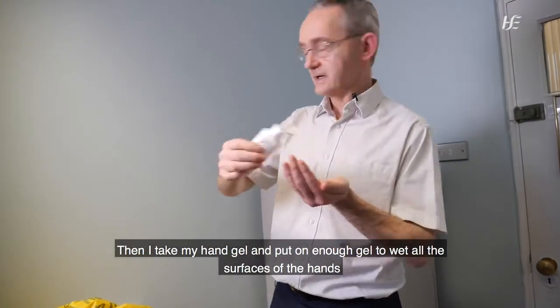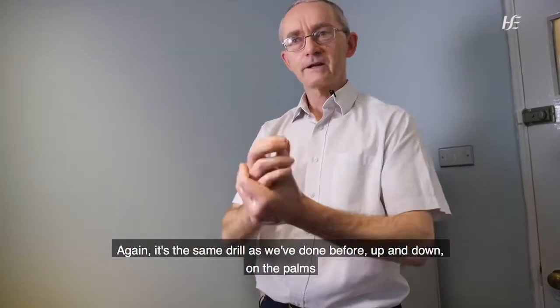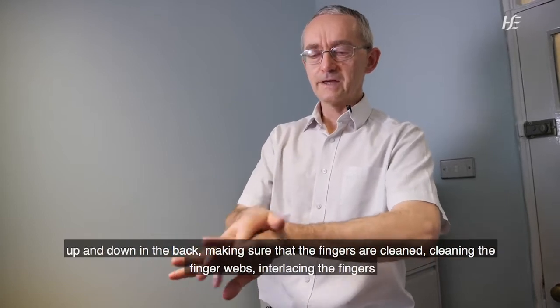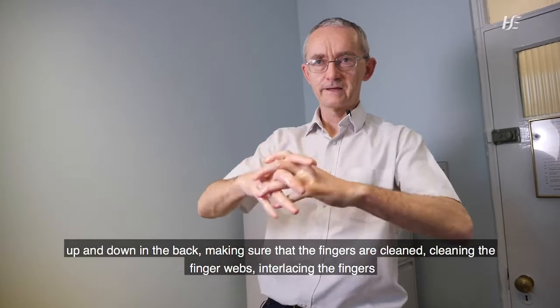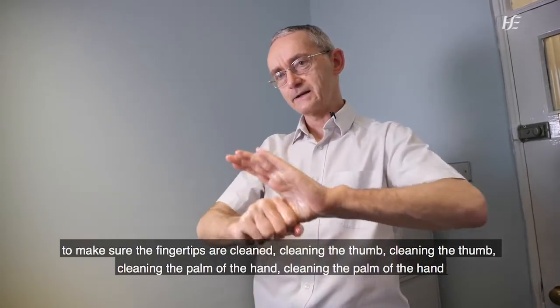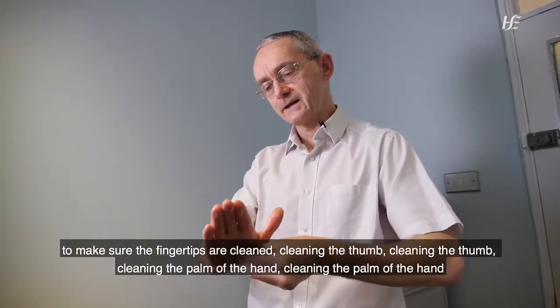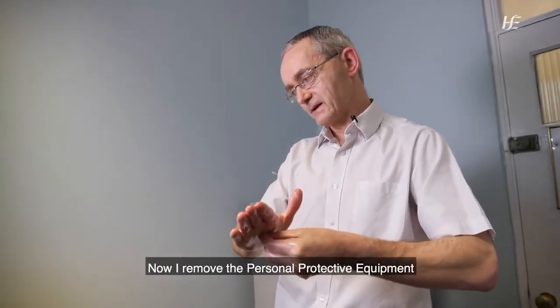and put on enough gel to wet all the surfaces of the hands. And again, it's the same drill as we've done before. Up and down on the palms, up and down on the back, making sure that the fingers are cleaned. Cleaning the finger webs, interlacing the fingers to make sure the fingertips are cleaned. Cleaning the thumb, cleaning the palm of the hand. And now I've removed the personal protective equipment.